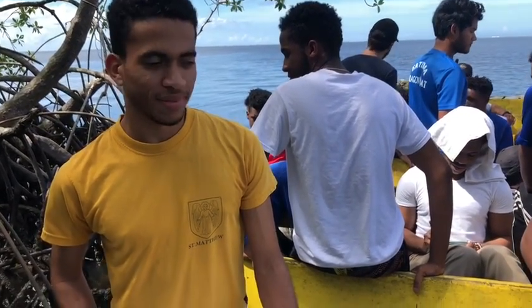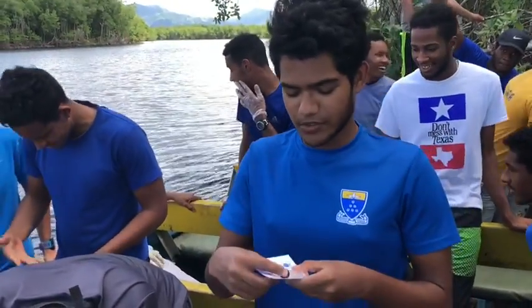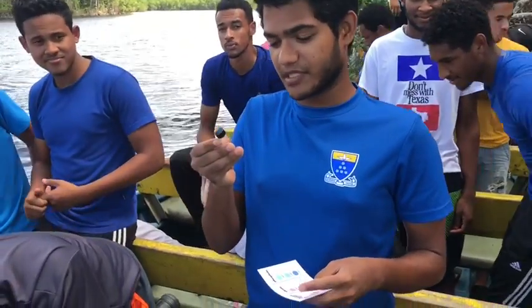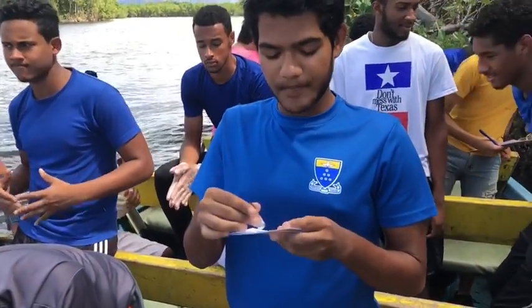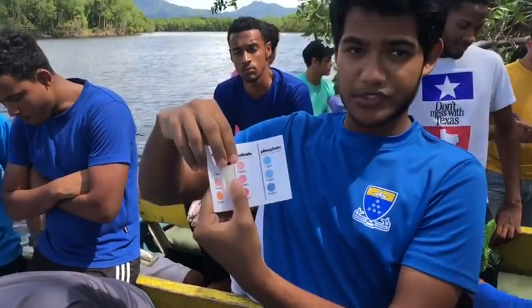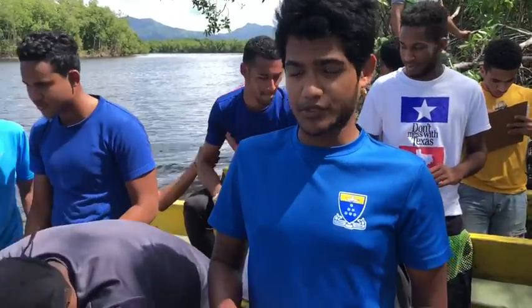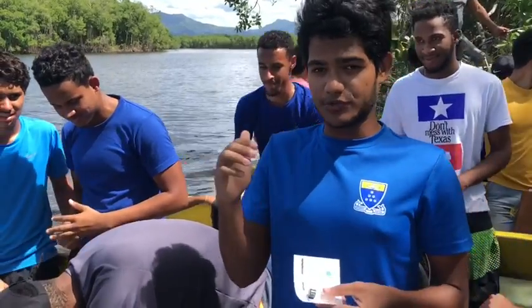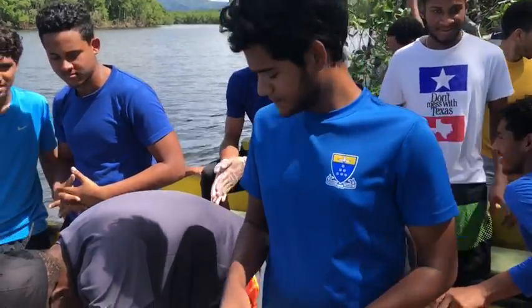We have Team D here and they're doing dissolved oxygen. What you have to do is get a water sample in this test tube, take a dissolved oxygen tablet, place it inside, close the cap, and then match it to the scale. They got 2 ppm — parts per million — and then you record the temperature, which they got as 28 degrees. Then you use a booklet to match the two values and get the final dissolved oxygen reading. Well done, Team D.